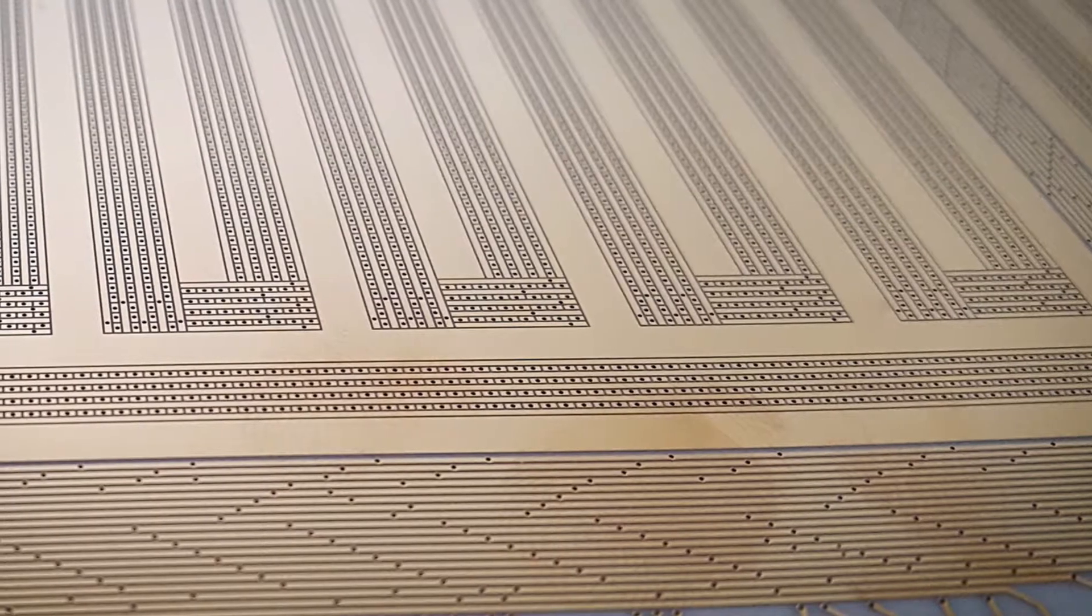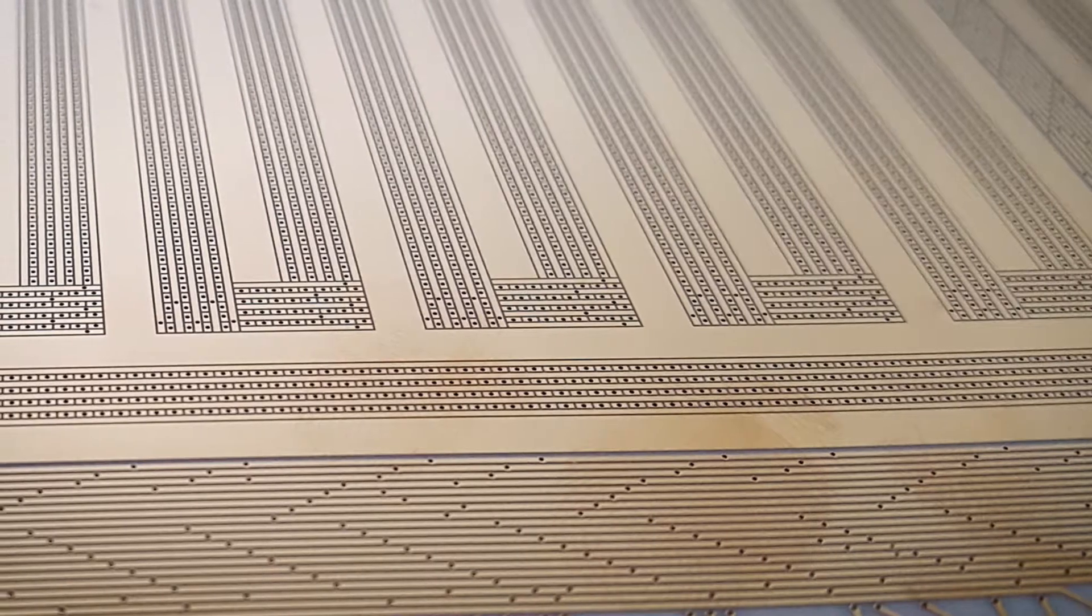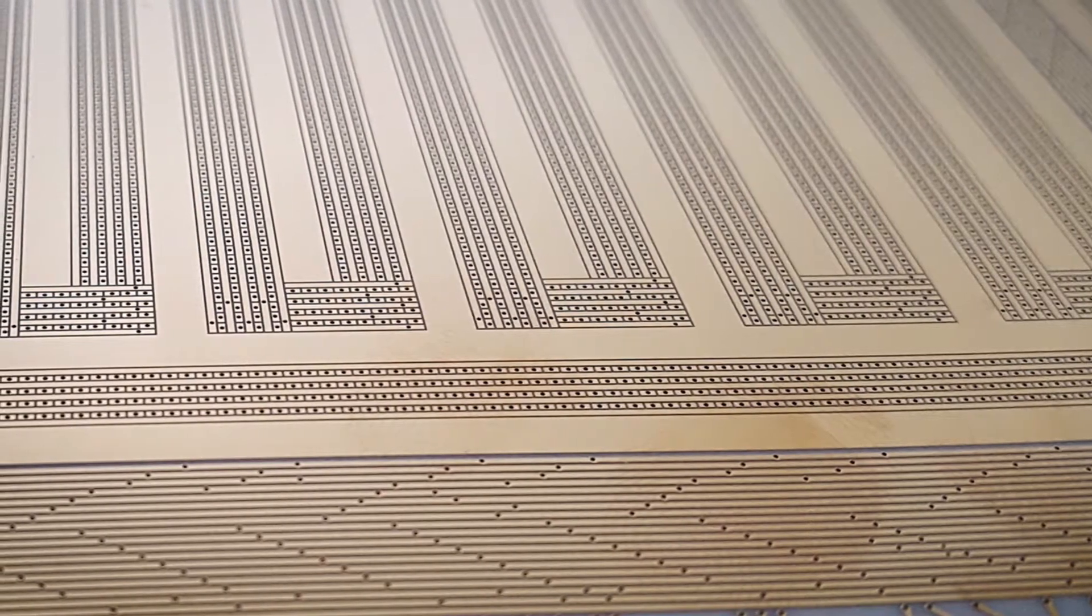We started in 2012, five years ago, with a one-hour brainstorming session involving about 10 scientists trying to solve one single problem, which is how we can turn ions around the corner at a pressure that's never been done before. From that moment, once you turn the ions around the corner, then you can turn them around two corners, three corners, and that allowed us to build what we now call the serpentine path SLIM.